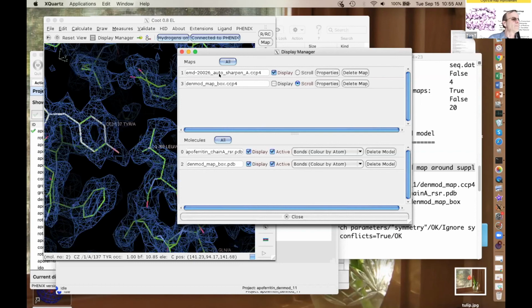Yes. And there was a question about what are the possible reasons for density modification not improving resolution in a noisy map? Basically, if any of the assumptions of density modification are greatly violated, then it might not work. And what are the key assumptions about density modification? One is the 2 half maps are more or less independent. Two, the molecular region can be differentiated from the solvent region. The noise in the solvent region comes from, so this is a key fundamental one, the noise in the solvent region comes from errors in the Fourier coefficients that also affect the noise in the protein region. That is a fundamental assumption: that the errors in the solvent region are correlated through the Fourier coefficients with the errors in the protein region. If for some reason that is not true, then it will not work at all.